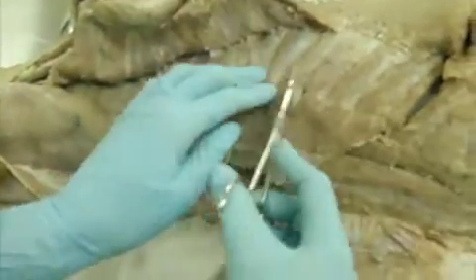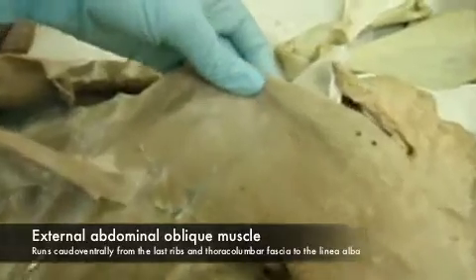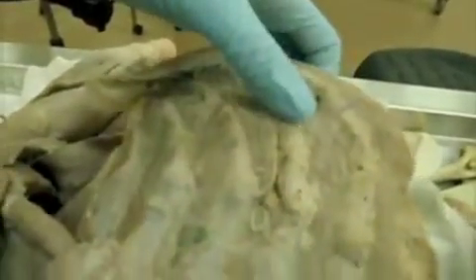What else do we have? Here we have your external abdominal oblique. You could see the fibers run caudoventrally, that direction. And you can see some of this specimen is kind of in bad shape, kind of moldy.